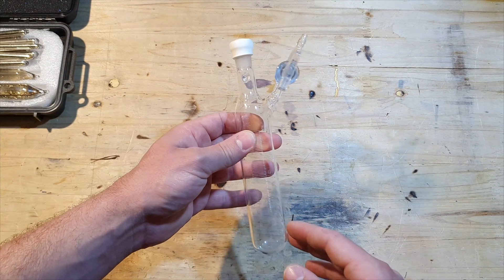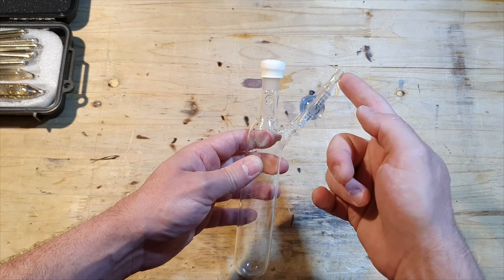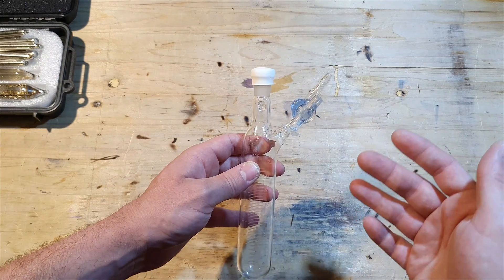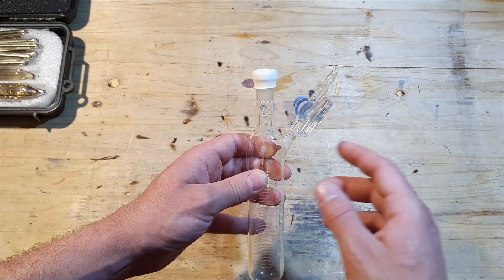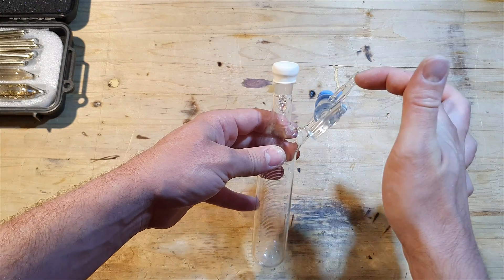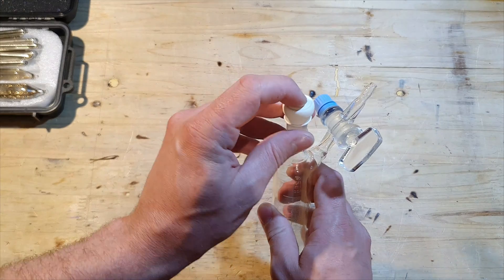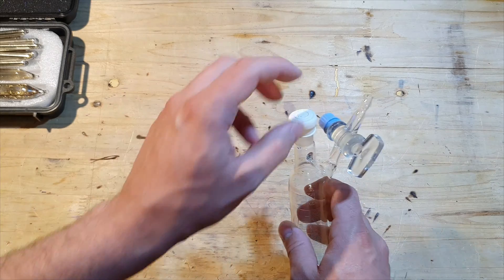These tubes are made for work under an inert gas atmosphere, so you would connect this here to a Schlenk line. A Schlenk line is just a line where you have inert gas and vacuum, and you can switch between those two. For example, if you wanted to take out something from this under inert gas, you would apply inert gas pressure here, and through this rubber stopper — it's a septum — you would use, for example, a transfer cannula out of stainless steel to transfer your chemical.